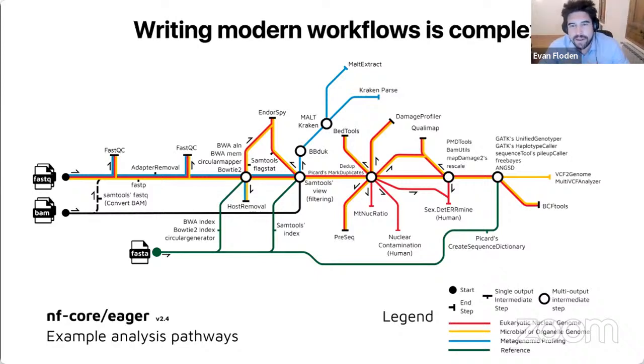You have to pull that all together into a piece of software which you can rely on. On the left-hand side here, you can see that we've got some data going into it. Bioinformatics itself, and most of the life sciences, is very file heavy with sequencing data. It's usually big, large files, and those in themselves present some challenges to how we're going to process them.